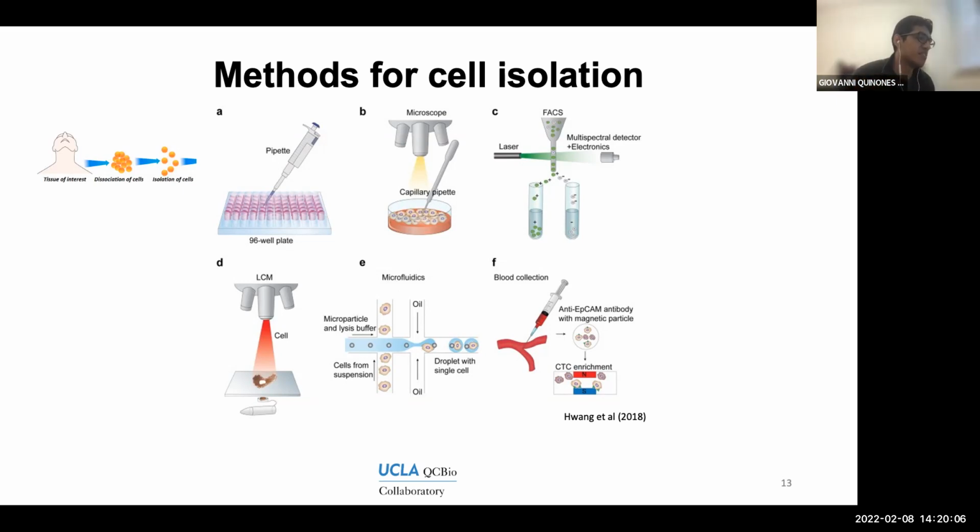So in this particular scenario, we have this channel where a solvent carrying some microparticles is passing through and merging with another channel where your cell suspension is passing through.